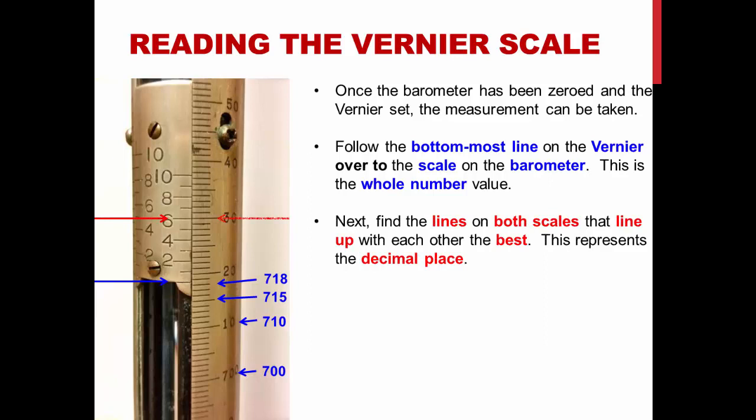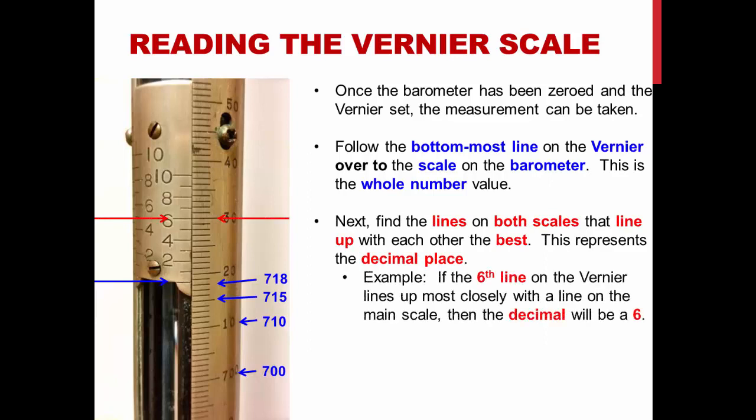Next, find the lines on both scales that line up with each other best. This represents the decimal place. For example, if the 6th line on the vernier aligns up most closely with a line on the main scale, then the decimal will be a 6. This barometer reads 718.6 mmHg.